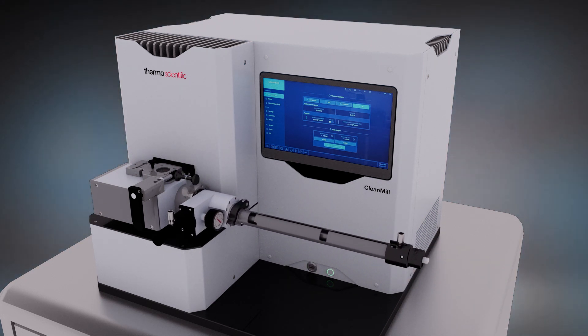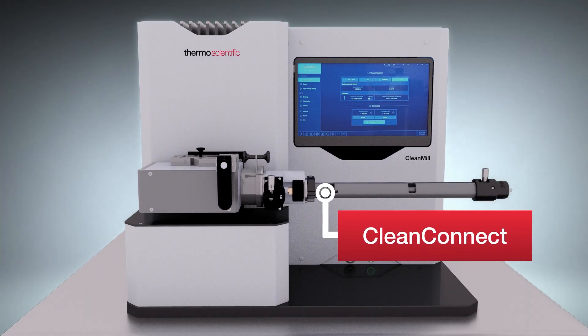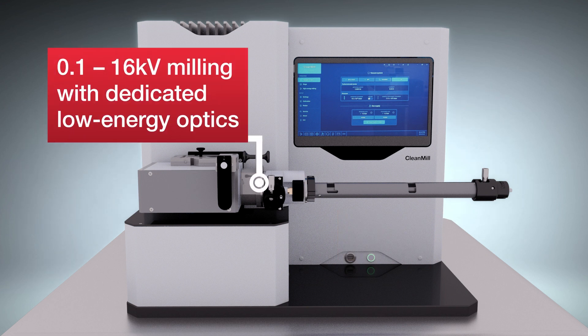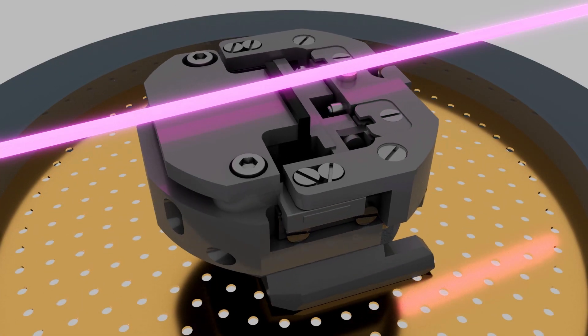When paired with a ThermoScientific Clean Connect sample transfer device, this milling instrument enables the sample to remain protected from preparation to imaging, featuring a wide ion energy range from 0.1 to 16 kilovolts. The system can deliver both ultra fine polishing and rapid milling.